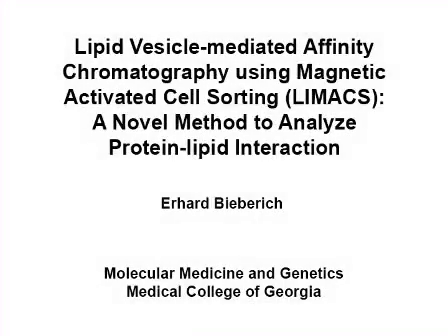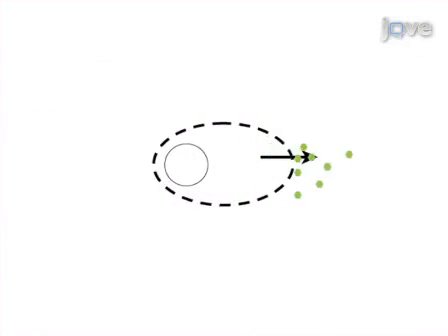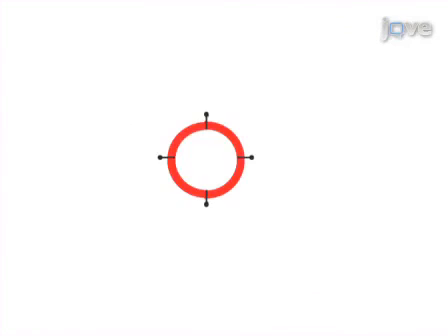This experiment is designed to identify lipid-binding proteins and to analyze lipid-protein interaction in a defined membrane environment of lipid vesicles. Proteins of cell homogenates are incubated with the freshly prepared lipid vesicles from phosphatidylserine and ceramide.